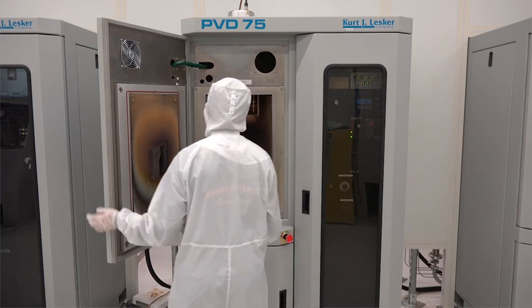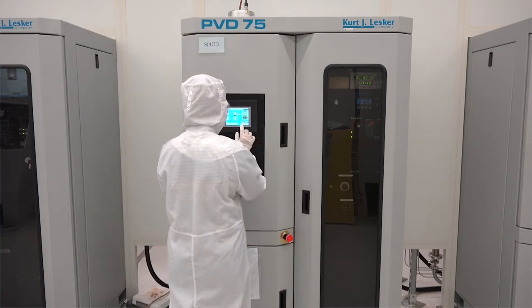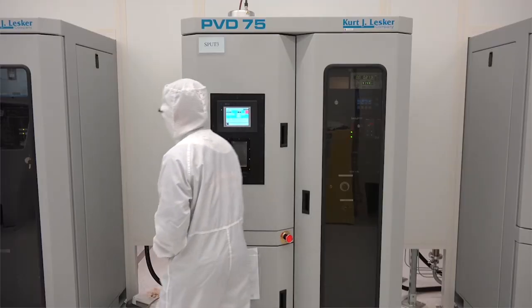Now let's close the door and pump down the chamber. To pump down, we select pump on the computer touchscreen. The computer controller will turn on the mechanical pump first, which will rough pump down the system to a pressure of a few torr. Then the computer turns on the high vacuum turbo pump, which will pump the chamber to about 5×10⁻⁶ torr. This is the vacuum level required by this system to do a sputter deposition. This will take about 1.5 hours.